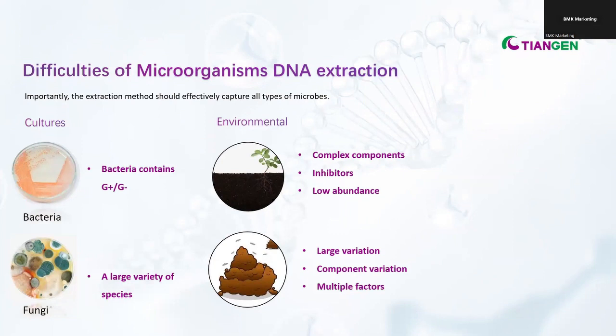So why is it so special when we talk about bacteria and fungi DNA extraction, and why can this microorganism DNA extraction be a topic? Because this type of sample has cell walls, which makes them more difficult to break open. There are some enzymatic and chemical methods that can get around this, but efficiency will vary depending on species, age, and stage of life cycle. Therefore, to ensure complete lysis, it is best to use a physical method such as bead beating to break down the cells with ceramic beads.